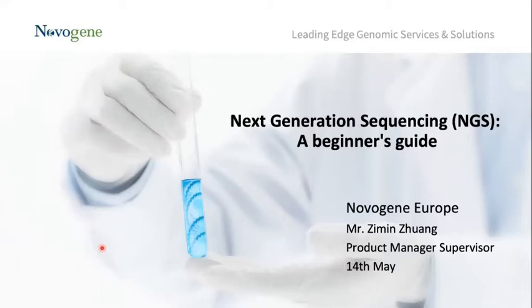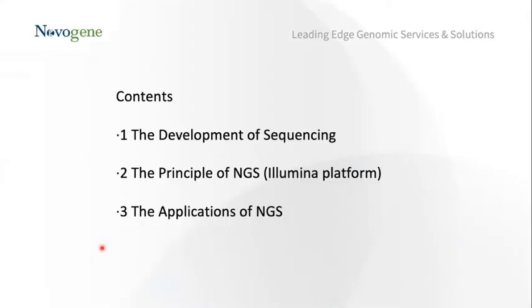And I'm going to talk to you today about some beginner concepts of next generation sequencing. The outline of today's talk will cover a bit about the history of sequencing technologies. Then we will focus on the principle of NGS, mainly on the Illumina platform, which most NGS is being performed on today. At the end of today's talk, we will spend some time to discover the applications of next generation sequencing and to see how Novogene can help you to achieve your research target.